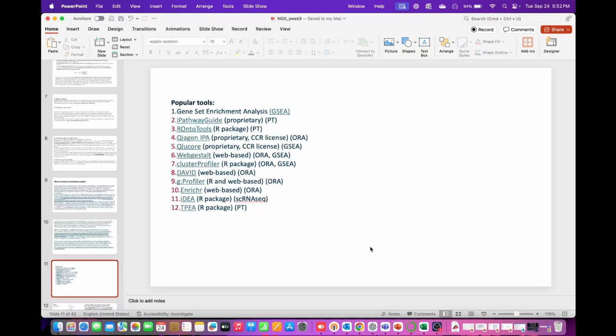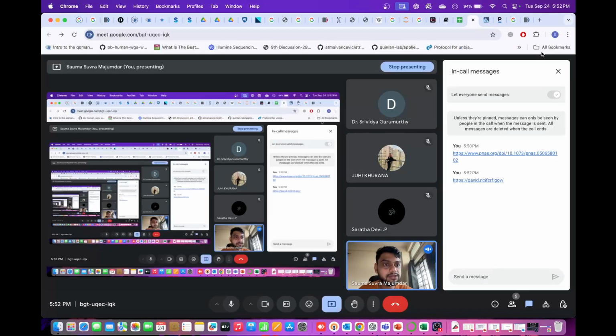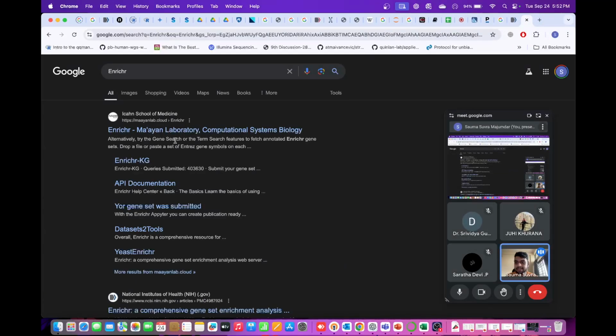Enrichr is also a tool that is quite commonly used.